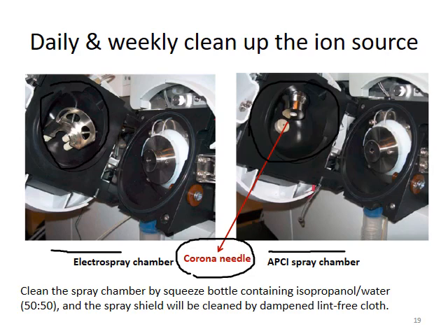But you should avoid spraying the contents directly to the spray shield. This is a spray shield. Doing so, you might introduce a large quantity of solvent to the capillary ion guide, which is not advisable. To clean up the spray shield, you can use a dampened lint-free cloth, which is usually provided by a supplier.